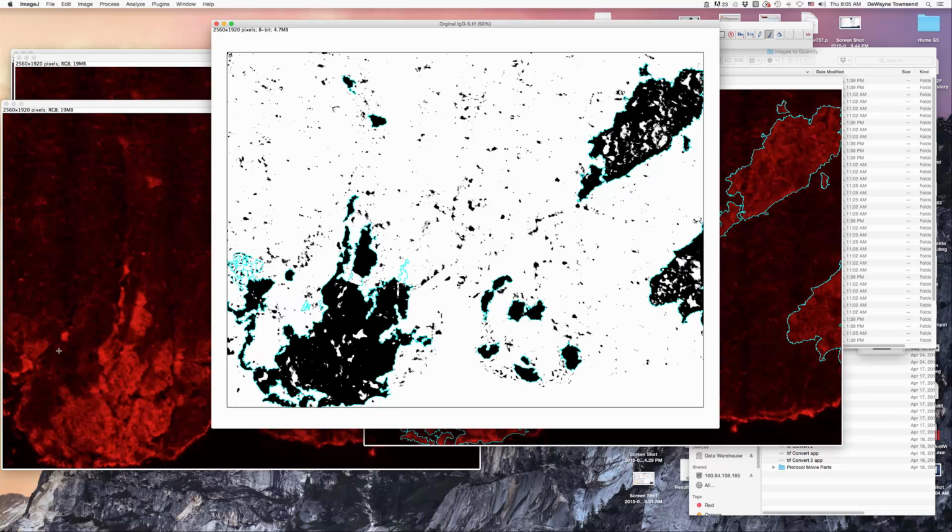Okay, so keep that area here, keep this here. Now this looks like it might just be edge, and this clearly is edge. So I'm going to get rid of these areas here, and this guy here. Okay, so that's good. And then down here, I'm going to increase my brush size again because it's getting a little more difficult. Okay, so let's do that. Let's get rid of this here to there. Keep this. Keep some of that. Alright, we got this going on.